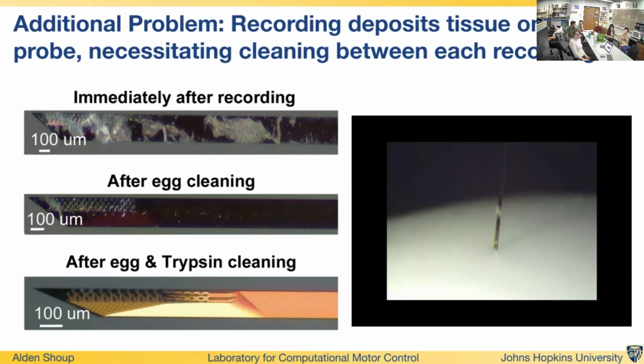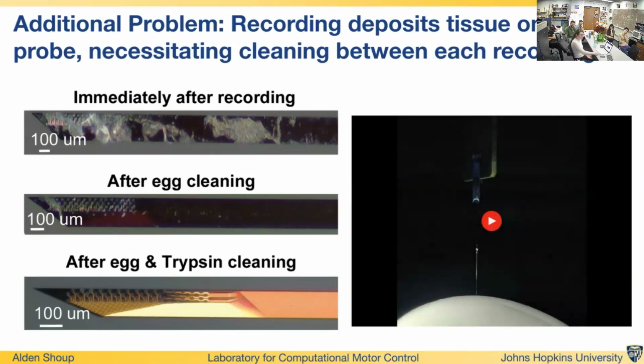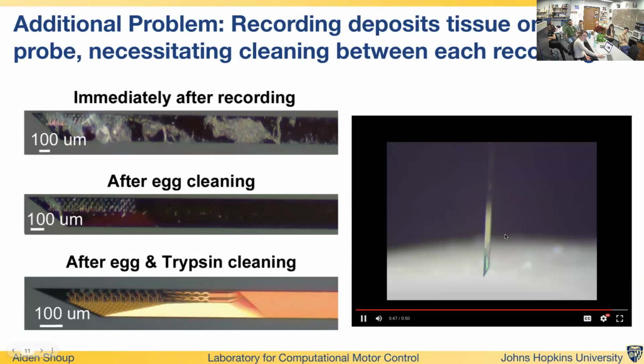And that's how we get a clean probe, and we spray some alcohol on it in between, and then we do it again. If you do it a couple of times, you can move over into a new hole in the egg, and then you redo it, and you basically iterate this process until you get a clean probe, which looks like this.